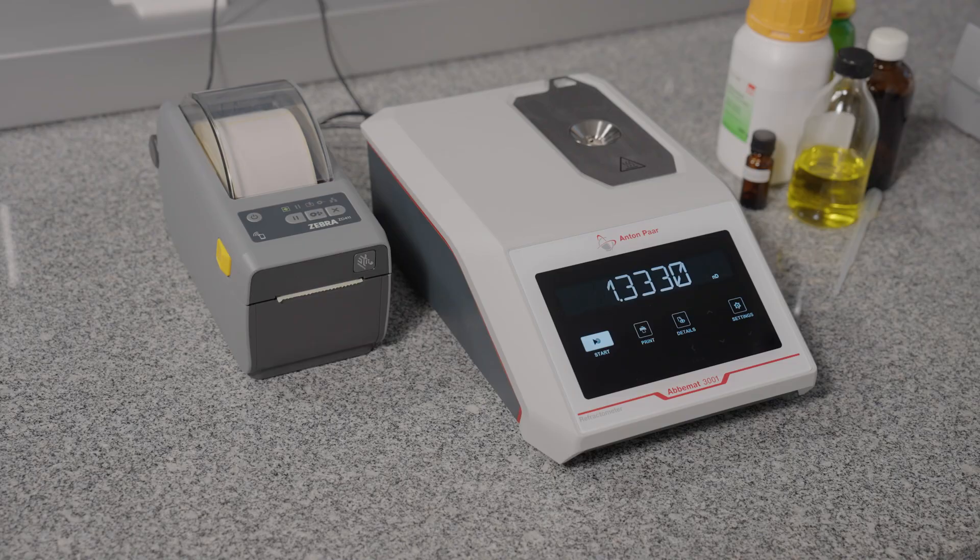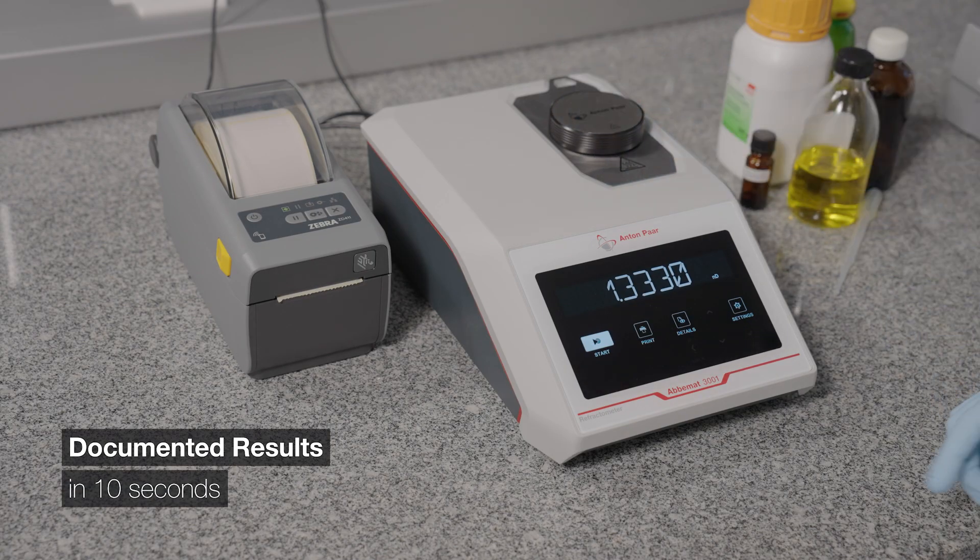A space as small as a lab book, one drop of sample, and less than 10 seconds are enough to get you the results you need.